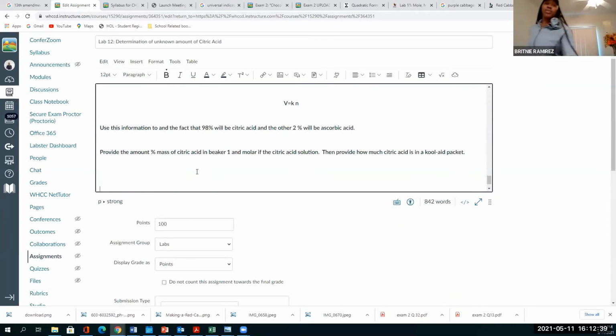For the baking soda, Dr. Henry, are you using distilled water or faucet water? I would use distilled water because your faucet water is going to be slightly off. Your distilled water technically should be right at 7.